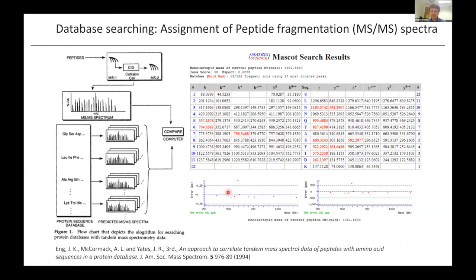And what we can also show in the diagram below here is that the match between the theoretical or expected mass and the mass error that can be calculated from that tends to be systematic in some kind of way. And it sometimes can depend on the mass analyzer. The data shown here is from an ion trap mass analyzer, where we see that the mass accuracy is lower at low m/z values and tends to be better here at higher m/z values.